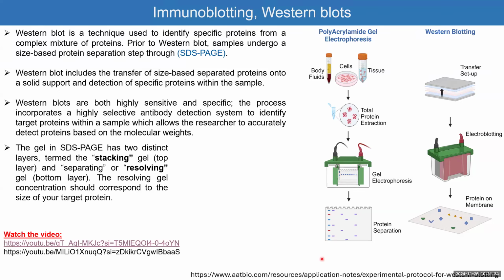And then you run. We discussed that we have a marker of molecular weights that we know. So we know the molecular weight of this blue, this red, this blue in the first. And this is our reference to estimate the molecular weight of the protein. And after running, we will have the samples. We don't see them like this unless we do the Ponceau, which is there.